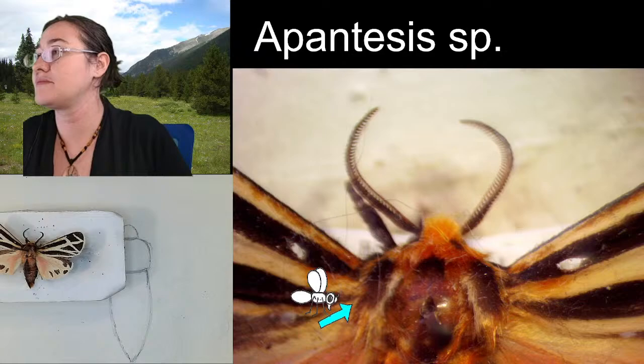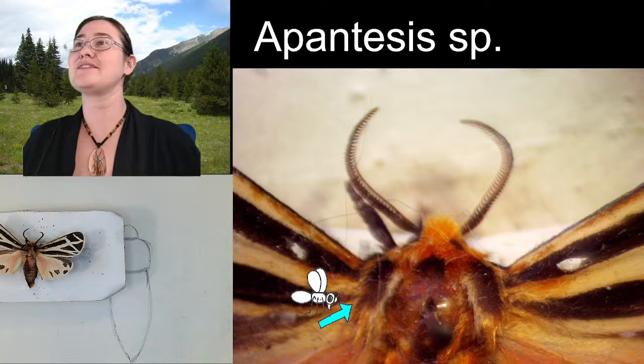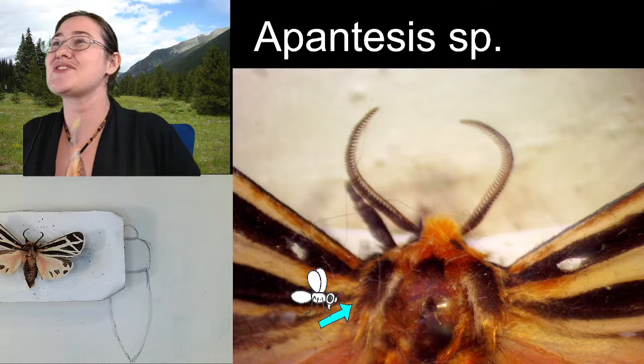If it was a bird, those would be the scapular feathers. Oh, cool. So scapula, like shoulder blades. Right? Isn't the scapula the name for our shoulder blades? So that is exactly in the right spot for those.